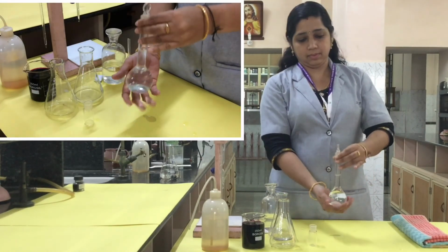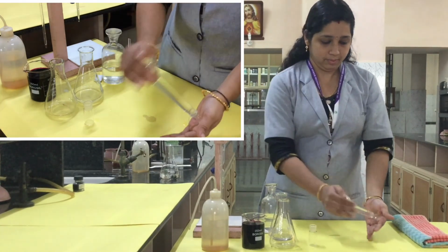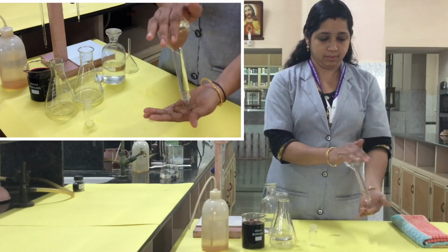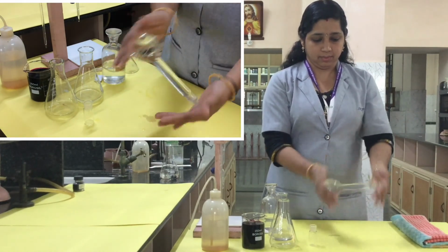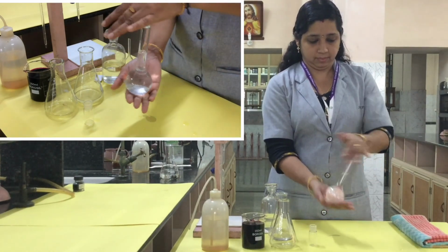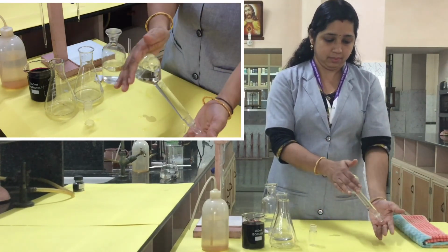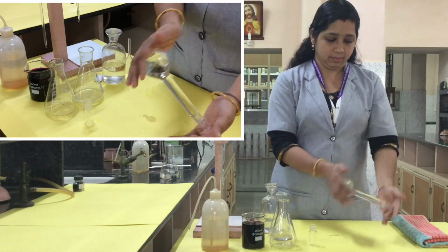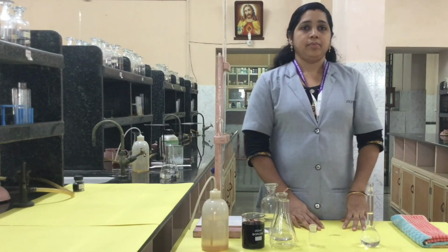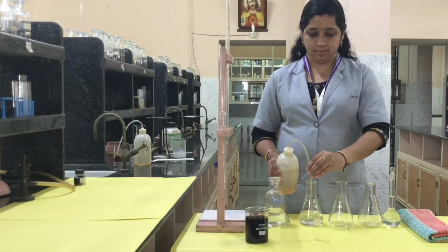Now we want to shake the solution. Shake the contents in the standard flask like this. Just shake well to get a uniform concentration. This shaking is very important while doing titration experiments. Before starting our titration, you will have to make a uniform solution. For that, shake it well. So now we got the standard solution of Mohr salt.